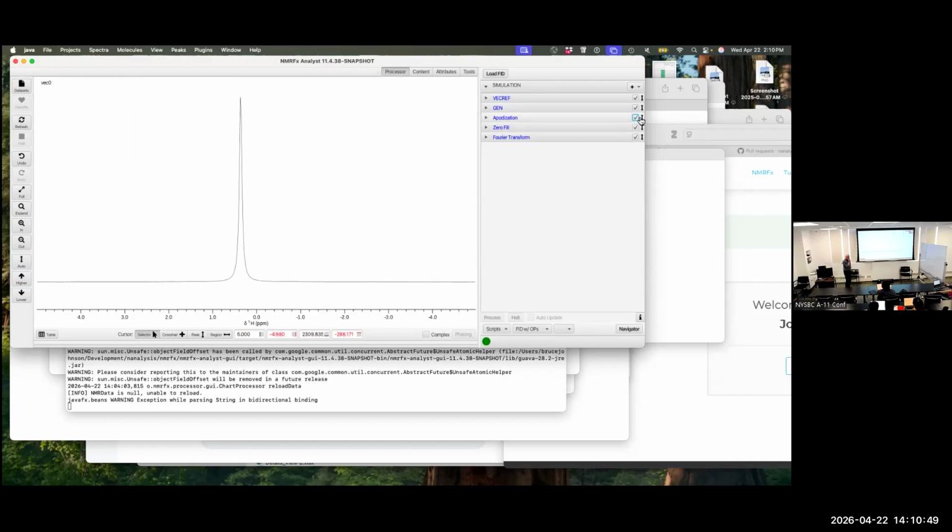There's a certain plus and minus when you zero fill. Remember I said that if you didn't apodize and the signal was not zero, you're going to introduce these sinc wiggles in the spectrum. I said that and then they weren't there. It turns out that if you don't zero fill, you typically don't see them. So if I turn off the apodization, turn off zero filling, okay, I don't see them. If I do zero fill, as I've told you, you should, you now see the wiggles, but indeed, I want to turn on the apodization to drive the signals down.